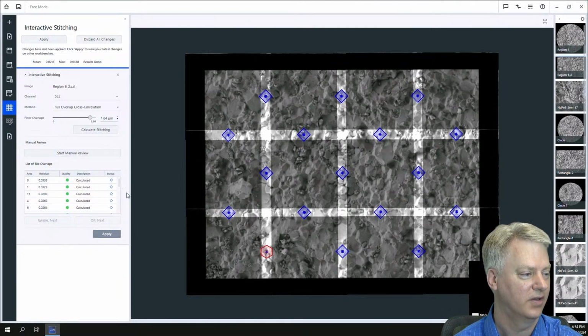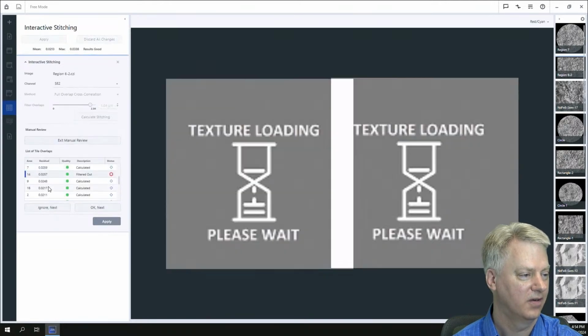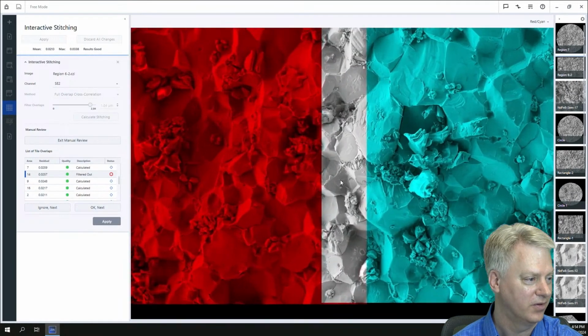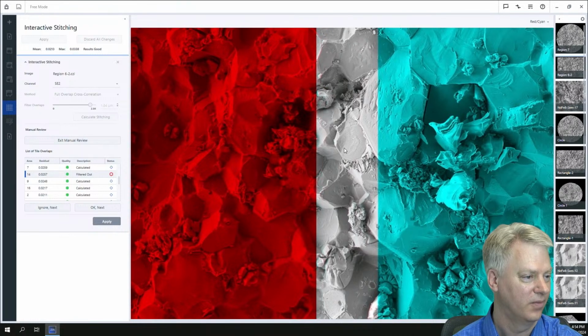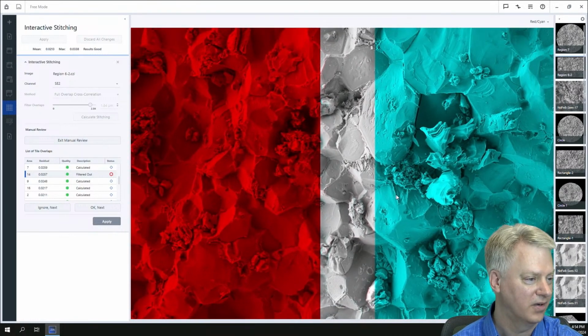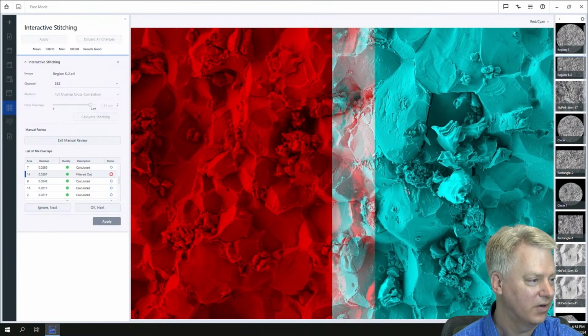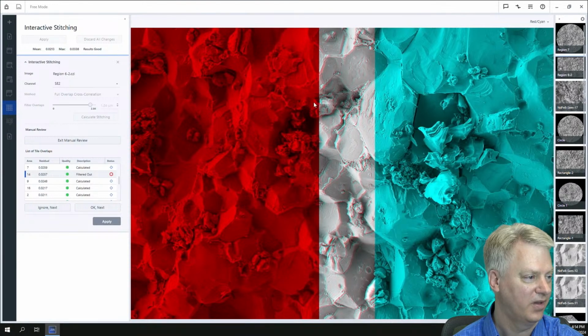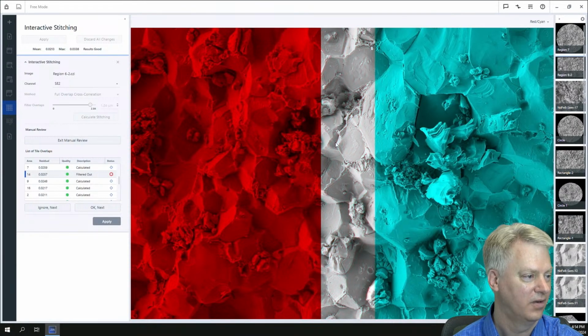So we'll have to deal with that and see why it decided that it wanted to do it as red. Maybe there's a small amount of mismatch. Maybe it just didn't have as accurate as what it needs to. We did notice that in the list here, where the green dots are, there's the confidence of the match and how well it correlated. So I'm going to just do it manually real quick just to double check. But I think this is probably the only tile that really needed it, and it looked like it was close.